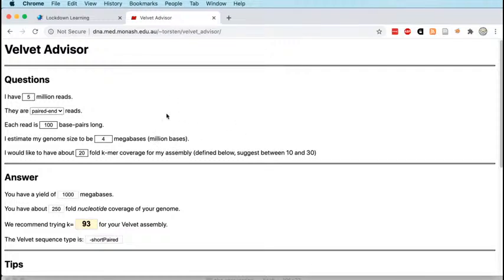It's quite long in the tooth now, and generally works with only very short reads, but nevertheless, this site continues to be relatively useful for this kind of calculation. So if we remember, we have 1.4 million reads. They are paired end reads. Each read is 208 bases long.